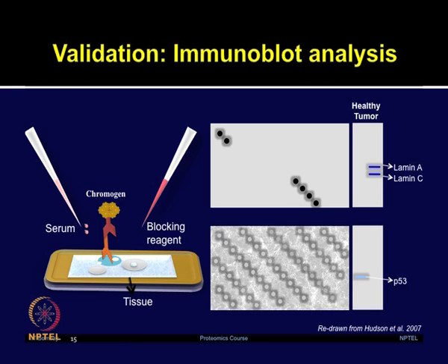Similarly, p53 protein was probed by using anti-p53 antibody. So, these Immunoblot assays and Western blot analysis confirmed and validated that the proteomic findings based on the protein microarrays were quite relevant, and the elevation of these proteins was validated by independent techniques.